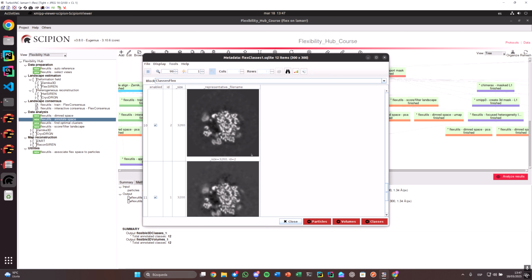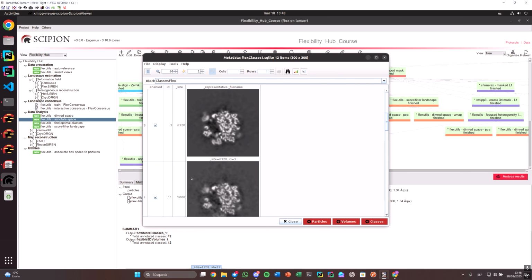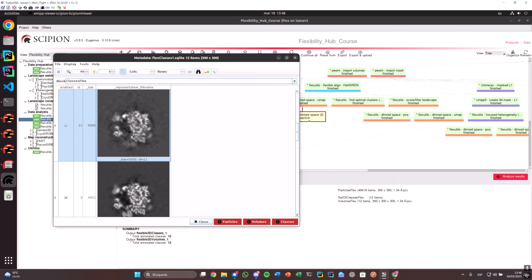For those regions that we have selected, for example, this last volume here, these are all the points that are selected and extracted to a different layer. And this one here, having a size of 5000, corresponds to this custom layer we created before, where we just click one specific point in the landscape. And here we are just associating the 5000 closest points to it, and of course the particles that are associated with those points. Let me open the protocol form.